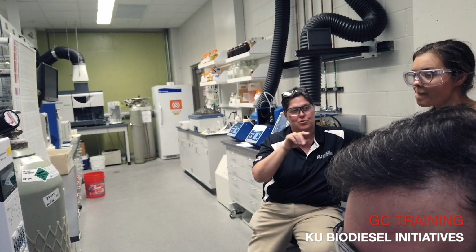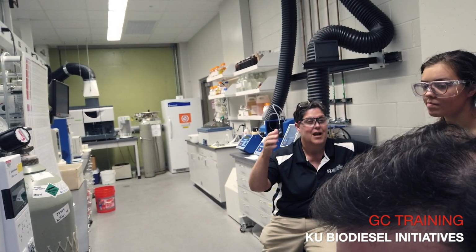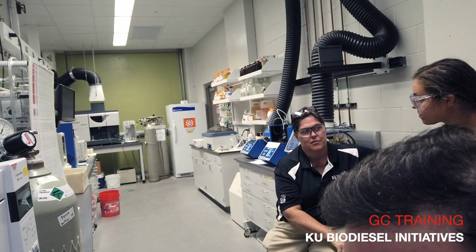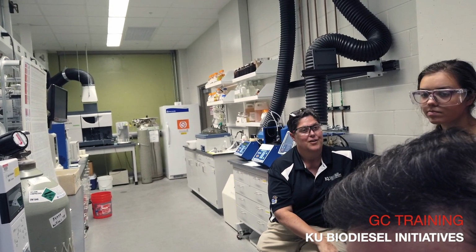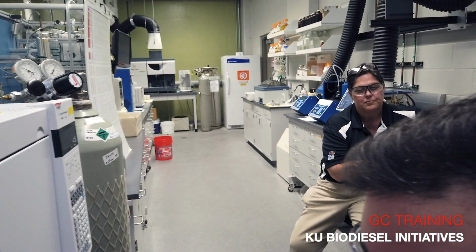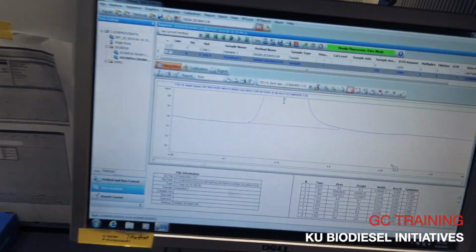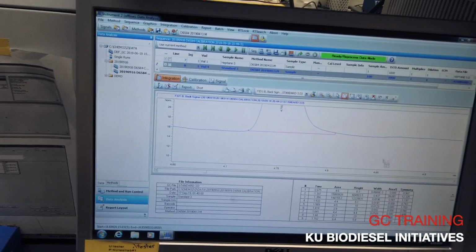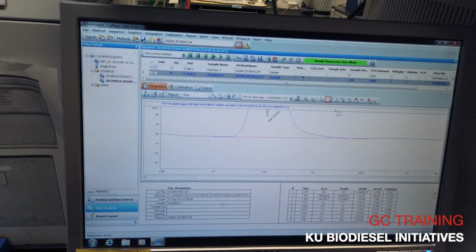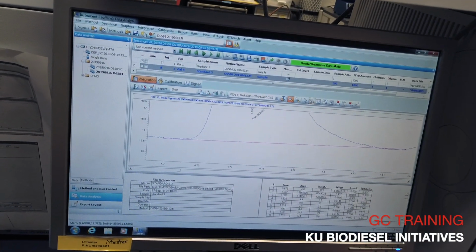A 4-point calibration means you're only using 4 of the standards. A 3-point would be only using 3 of the standards. So if you have an outlier, you should re-inject that and try to adjust it so that you can have a 5-point calibration curve, because the method says that's what's required to satisfy their standard. I mean, you can technically eliminate one, and I think at REG it was like 3 nines was sufficient. So it depends.